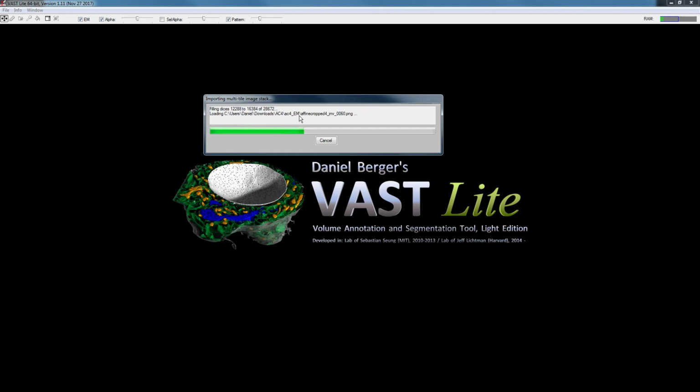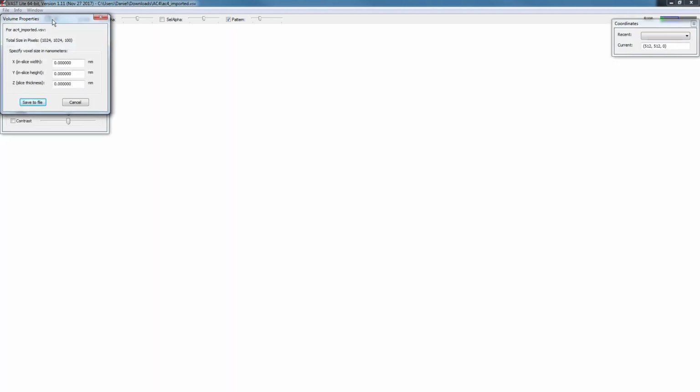So it's loading up the images, dicing them, saving them into your file, and when it's done with the full resolution data, it will generate the MIP maps. So it will actually take longer than the bar reaching the end here, a little bit at least.